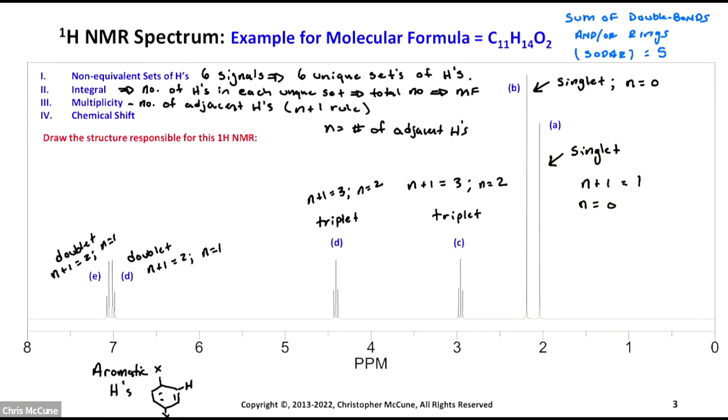The reason I know this, if it were, say, benzene, I would have 1 signal. If it was a benzene ring, let's say it had 5 hydrogens attached, and then some non-hydrogen group, I'll just call X, then the unique number of hydrogens, I would have 1, I would have 2, and I would have 3, so I would see 3 signals, not 2.